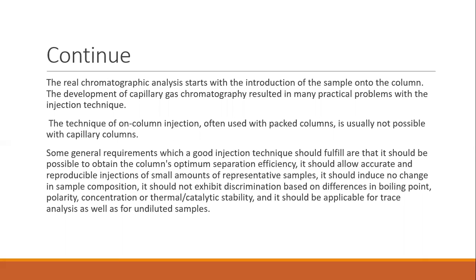Some general requirements which a good injection technique should fulfill are that it should be possible to obtain the column's optimum separation efficiency. It should allow accurate and reproducible injections of small amounts of representative samples.